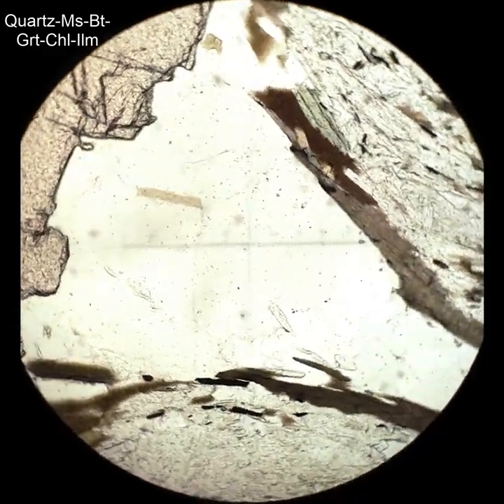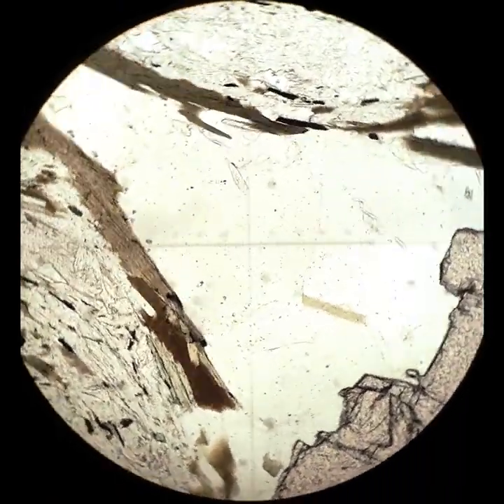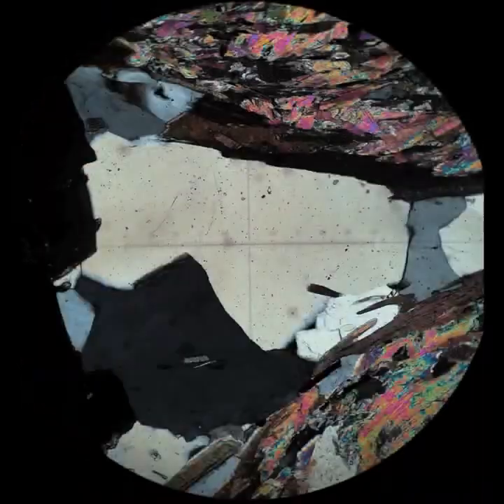This is quartz adjacent to a garnet in a pressure shadow, and it's thoroughly typical of quartz that you see in thin section. Low relief, clear in plane polarized light, no pleochroism. When you cross the polars, you'll see it's essentially black and white and gray as interference colors. There's maybe a hint that this largest grain is starting to break up into smaller subgrains, but it's almost completely optically continuous. It may be slightly yellowish because the thin section could be just a little bit too thick.